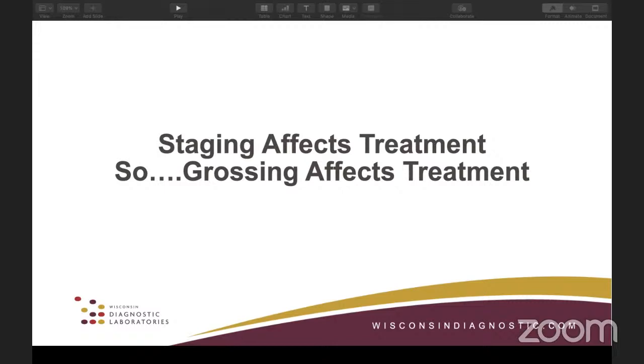So the lesson there is, of course, make sure you're looking for any additional lesions, but also, radiology and radiology imaging is not a substitute for your own eyes. And I've had examples of this at my job as well. So that's something to keep in mind.